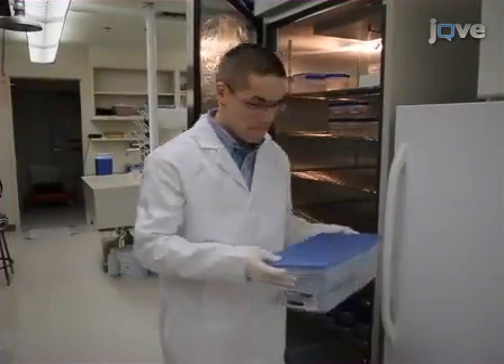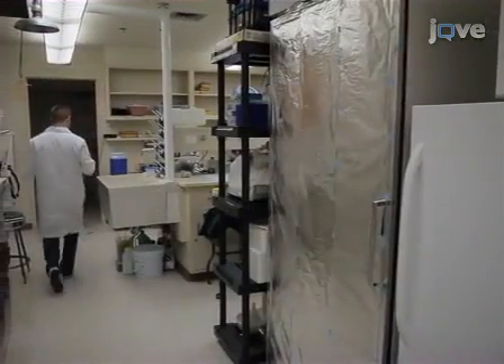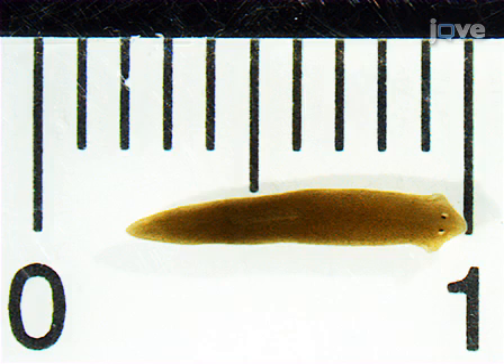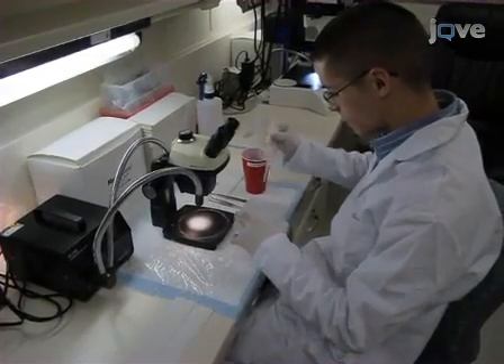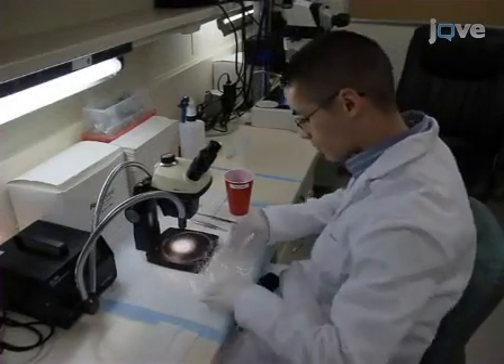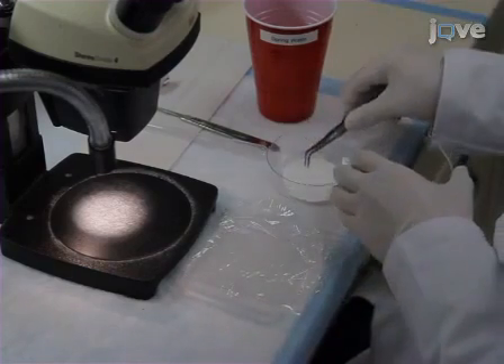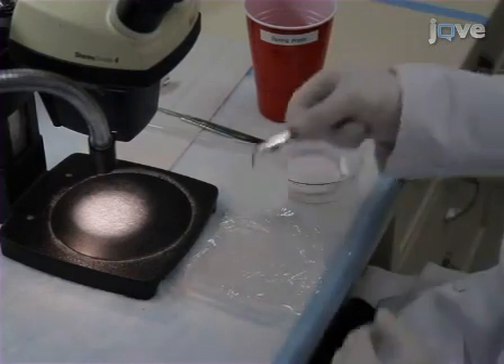In preparation for the assay, stop feeding a cohort of approximately 30 planarians for at least 5 days. After starvation, the worm should be between 8 and 10 millimeters long. On the day of the assay, rinse a pre-frozen leveled ice dish with water, and cover the flat iced surface with plastic wrap. Using forceps, place one filter paper on the plastic wrap.